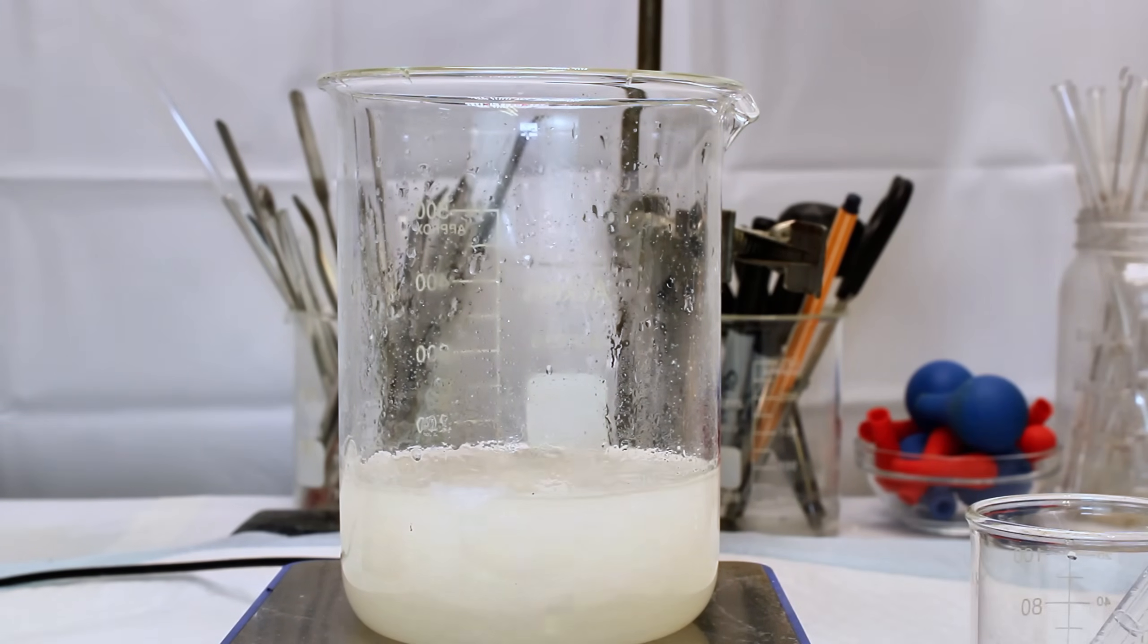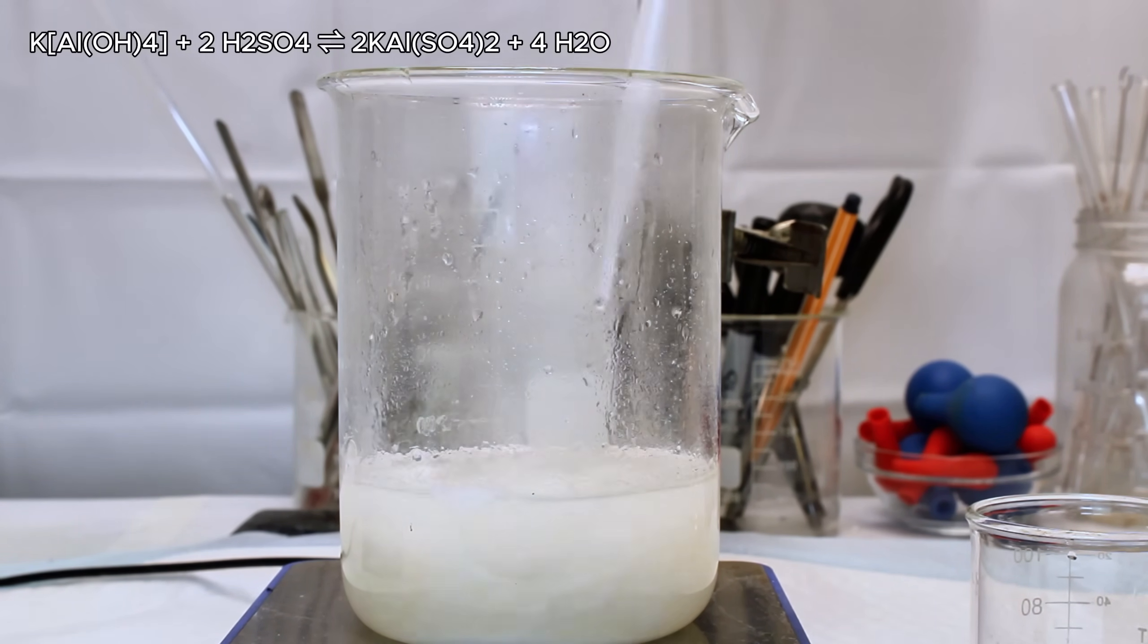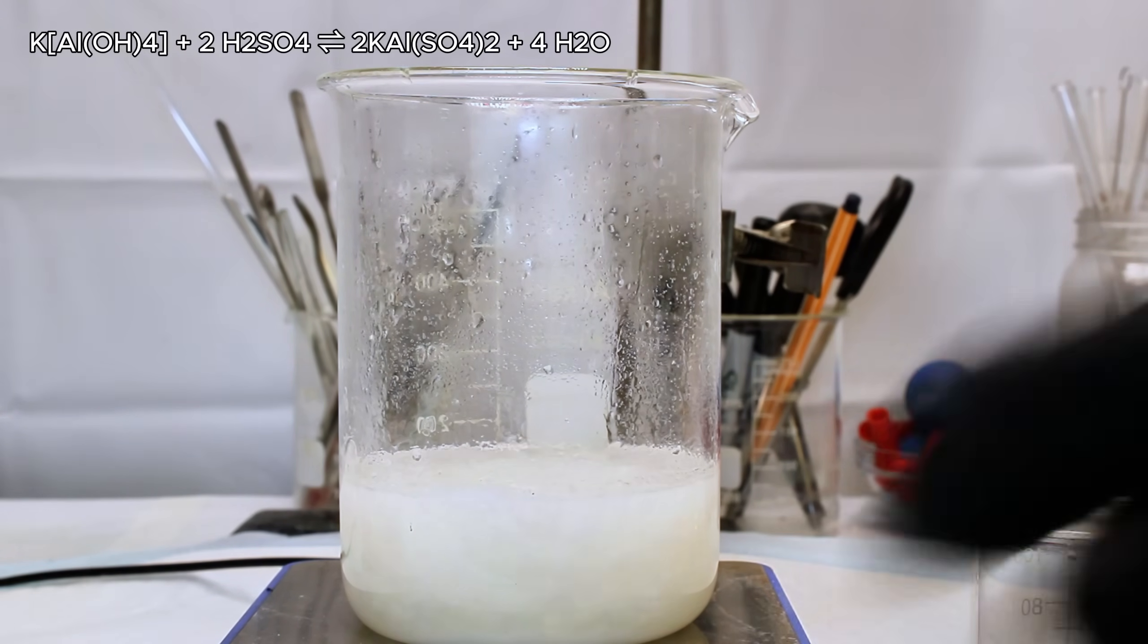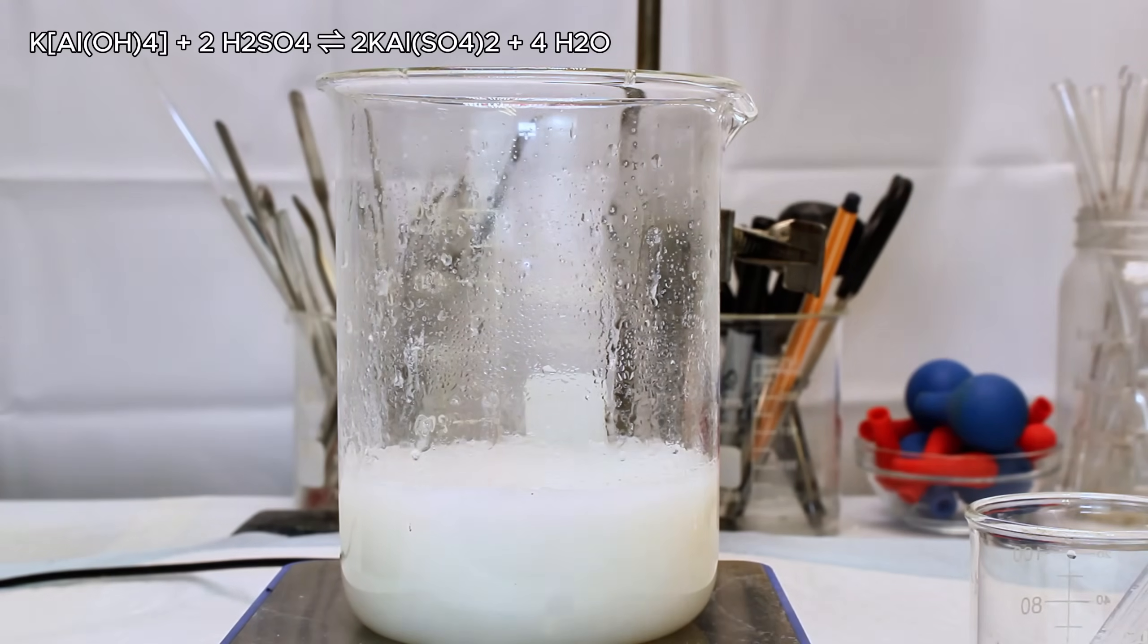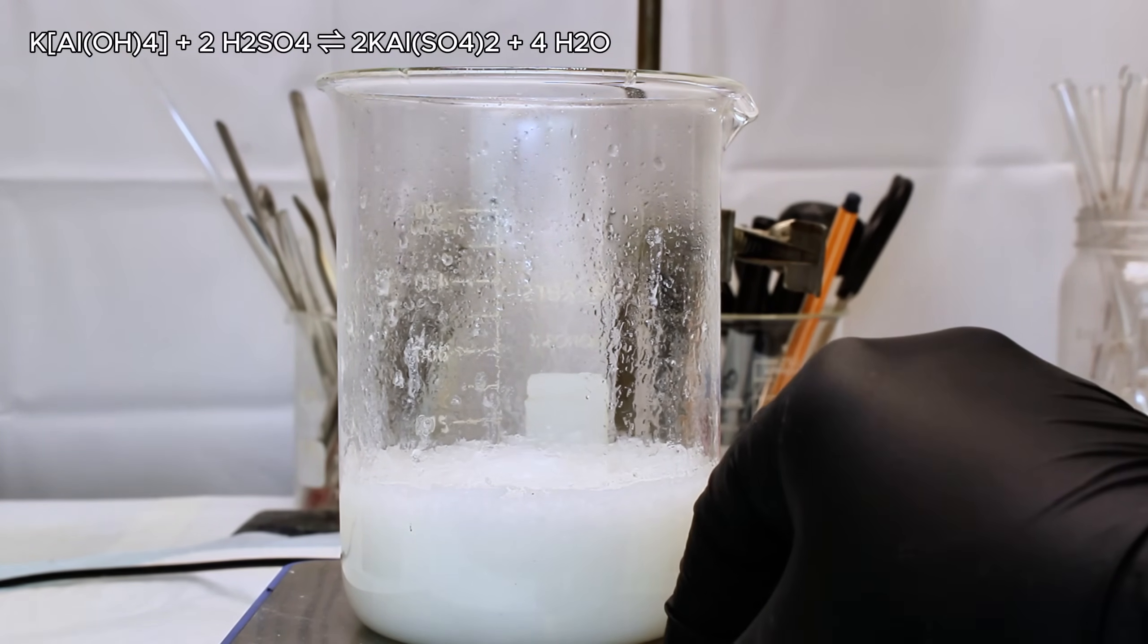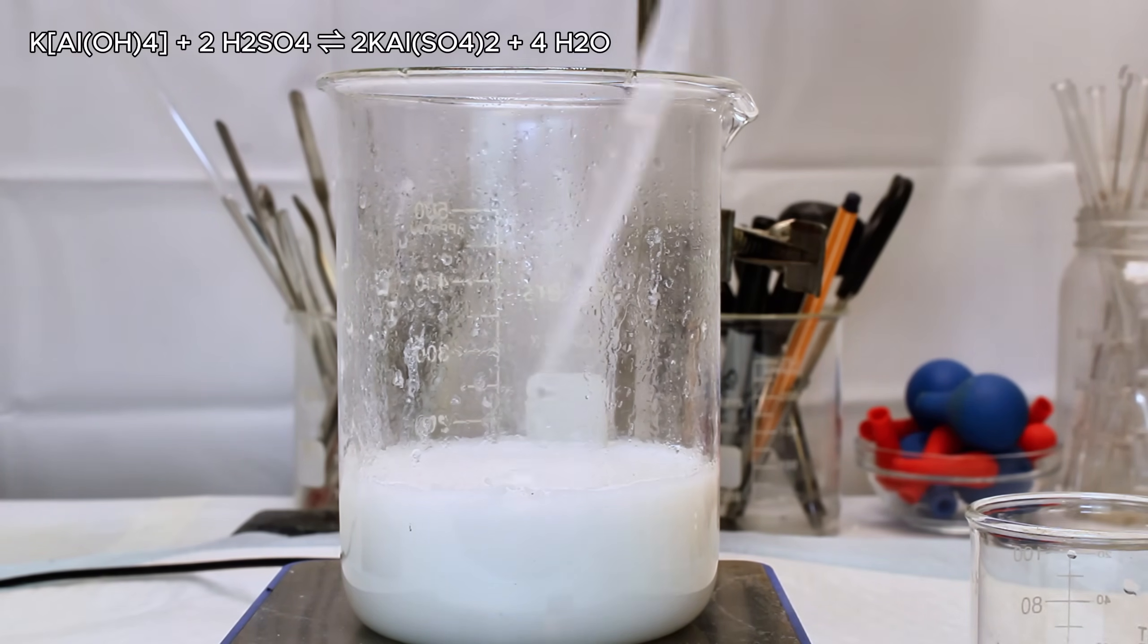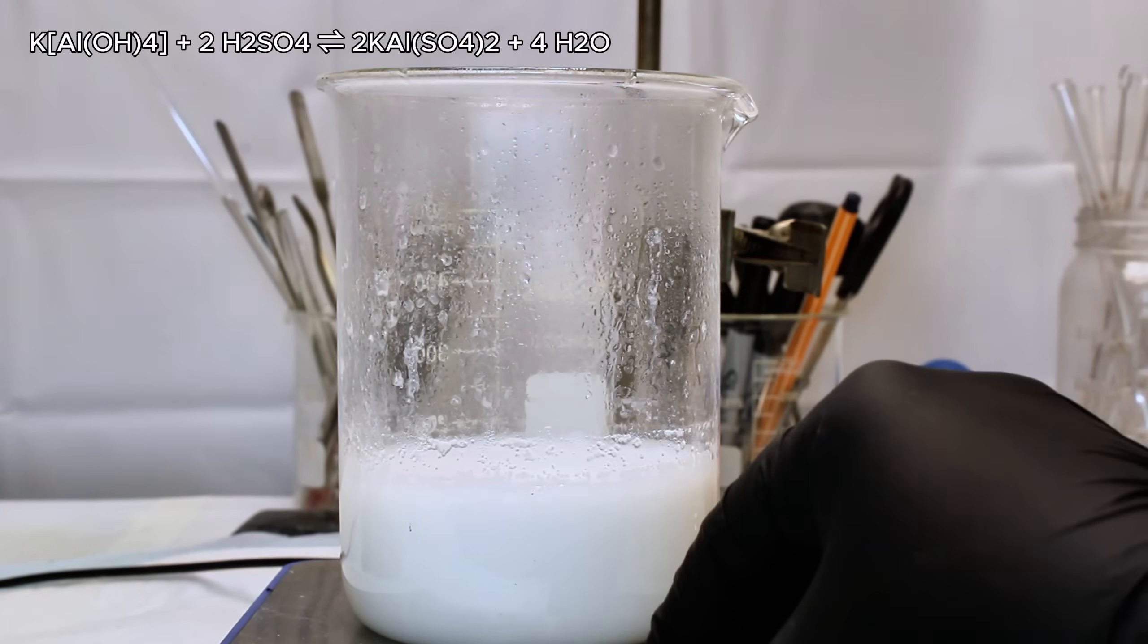Anyway, as the solution neutralizes, the potassium aluminate will first form insoluble aluminum hydroxide and very soluble potassium sulfate. However, as the solution acidifies and reaches a pH of around 3, the aluminum hydroxide will form the target chemical potassium aluminum sulfate, or alum.